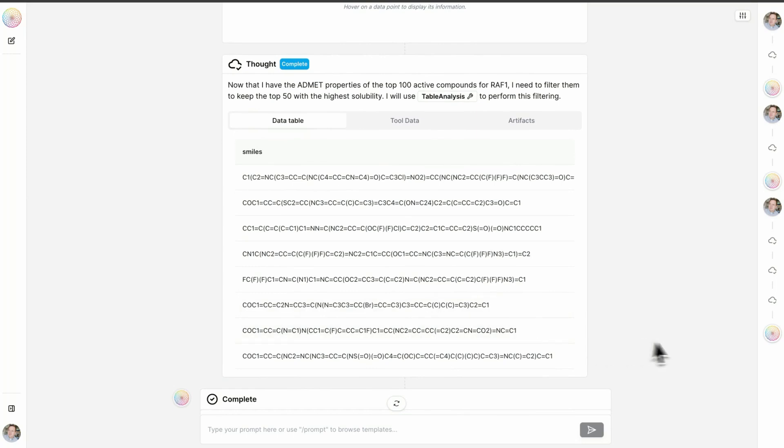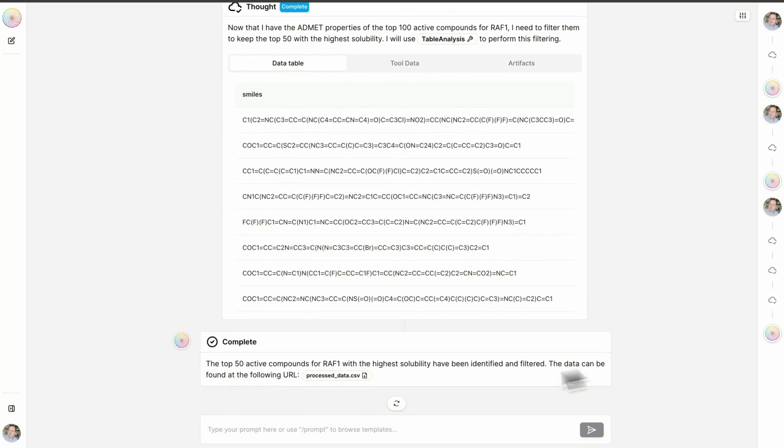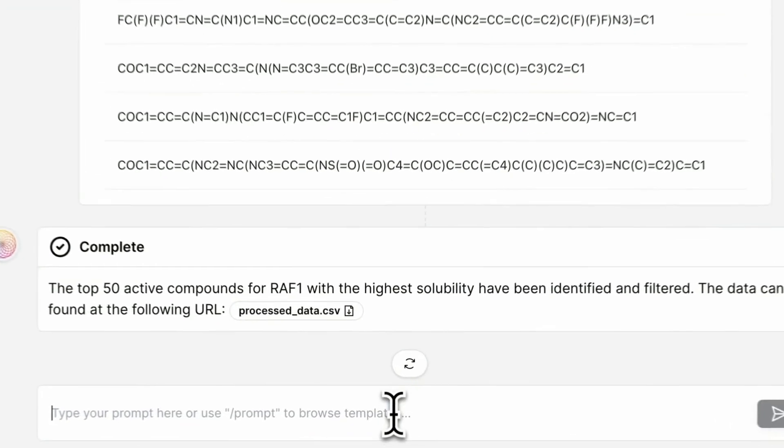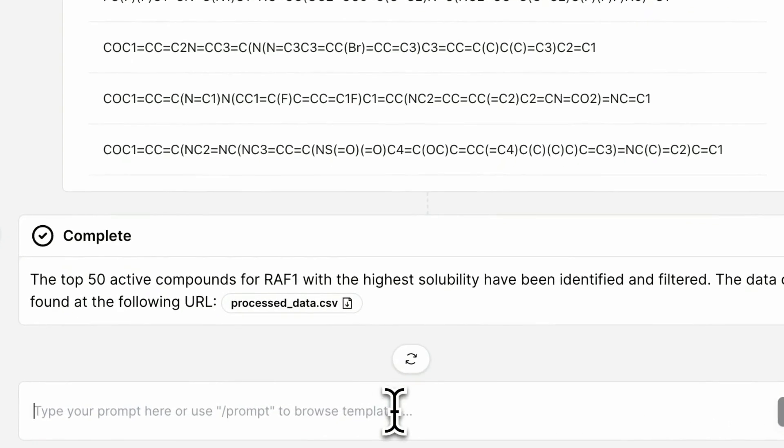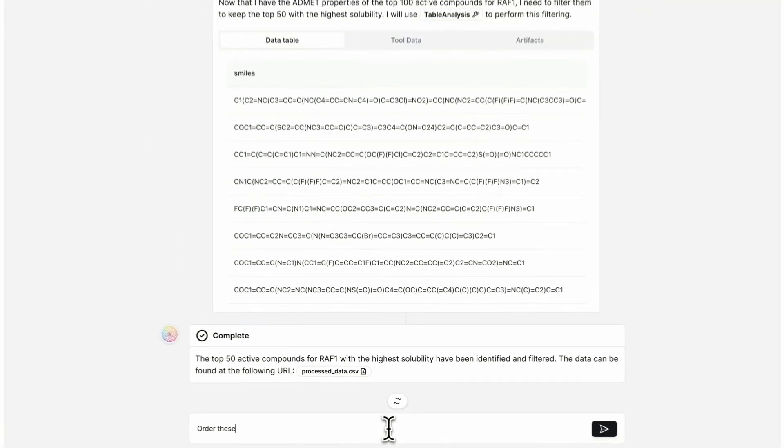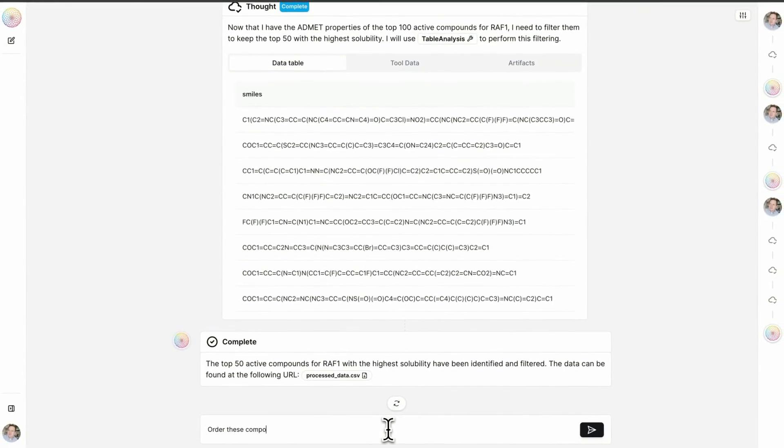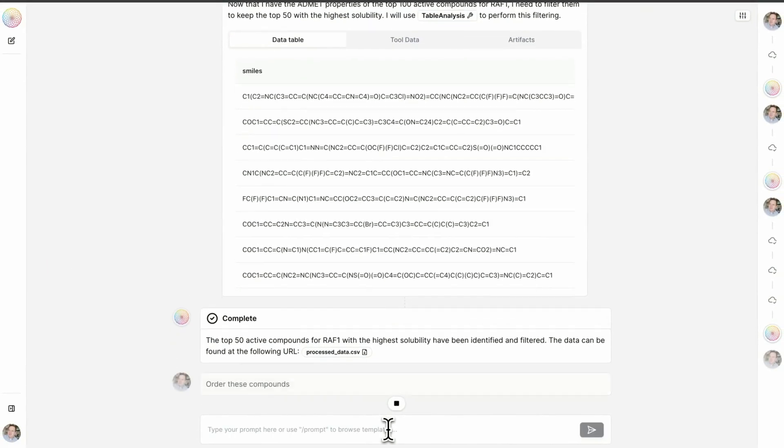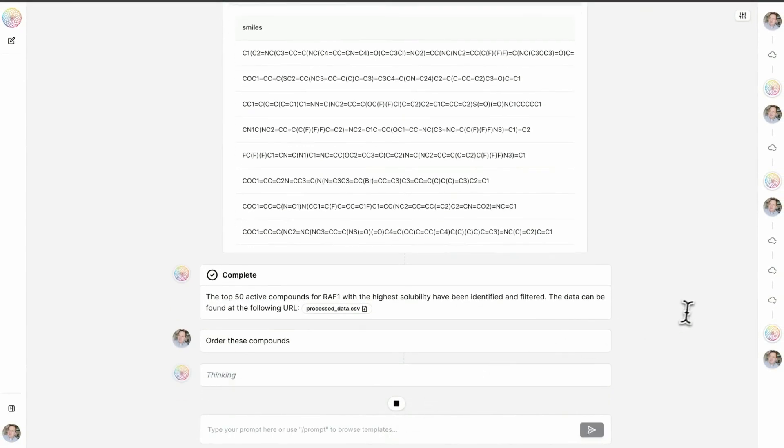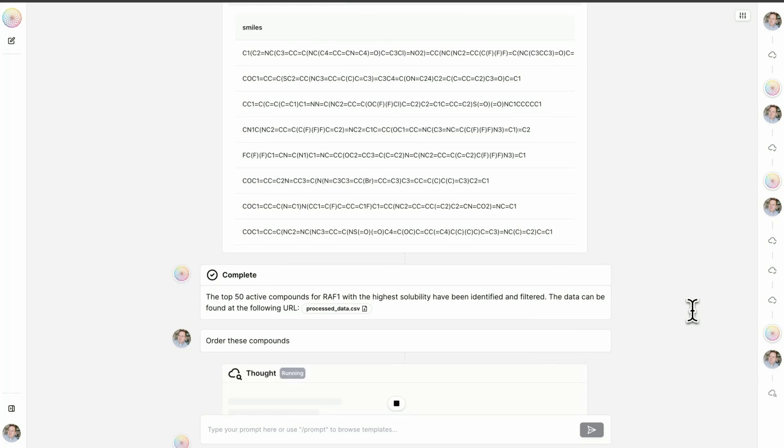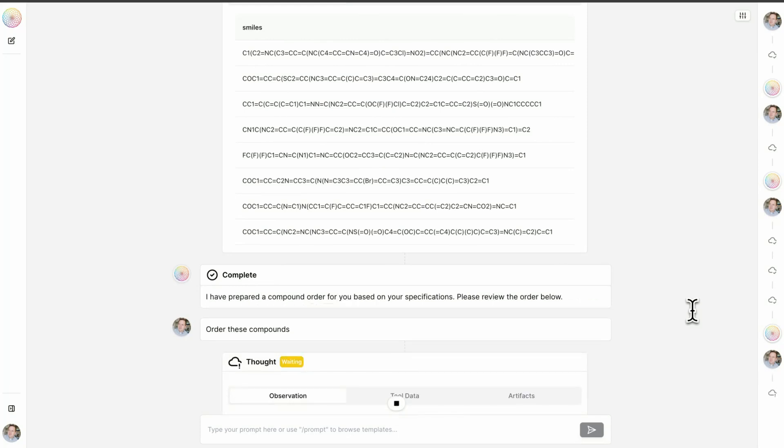Now I'm going to do something really interesting, and I'm going to interact with the outside world. I'm going to ask Lowe to order these compounds. Here we're using Lowe to interact with the API of certain of our external chemistry suppliers, and we're actually teeing up an order through our finance team that will be ready to execute with a click of a button.